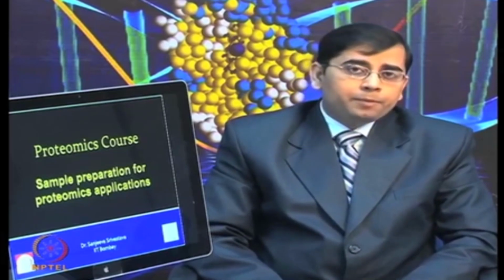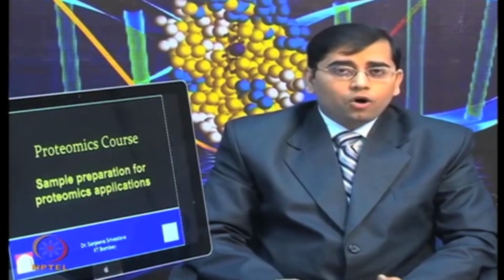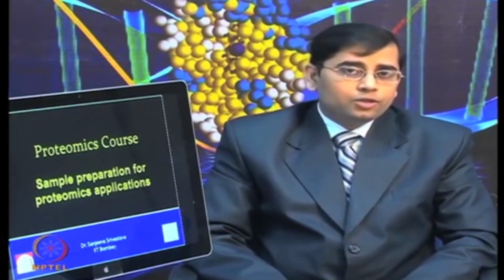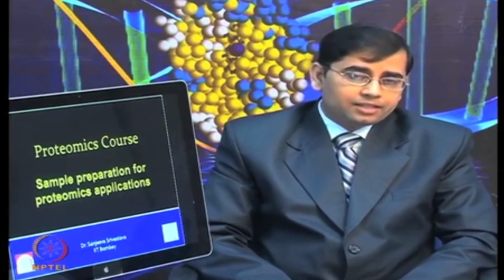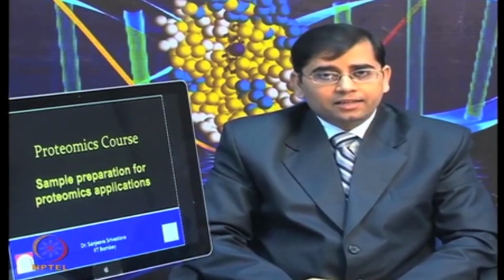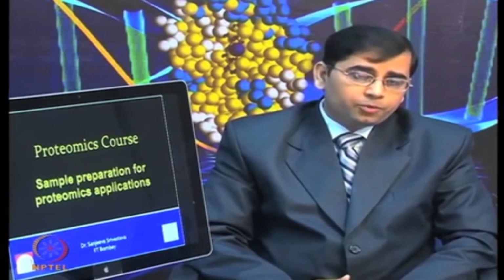An ideal sample preparation will ensure that you have all the protein present in your sample without different types of contaminants such as nucleic acids, salts and other interfering components.